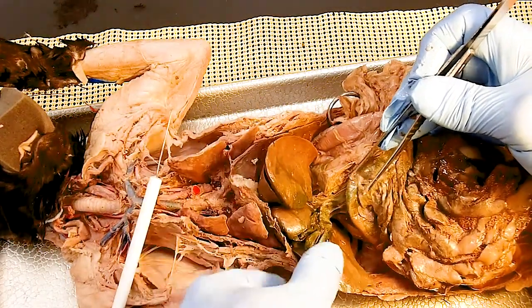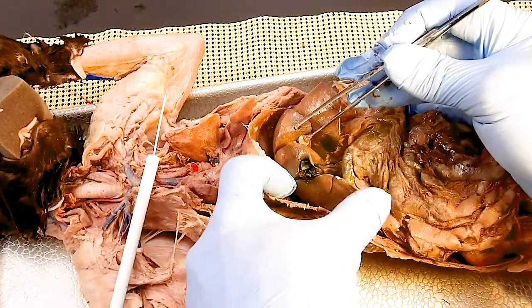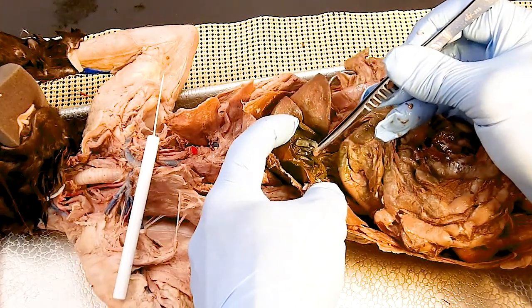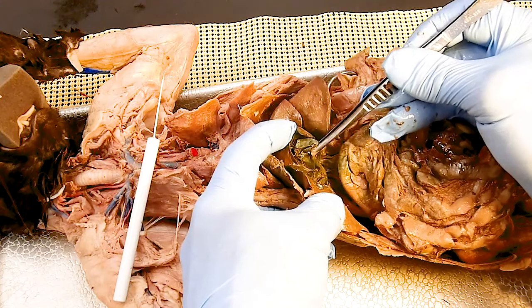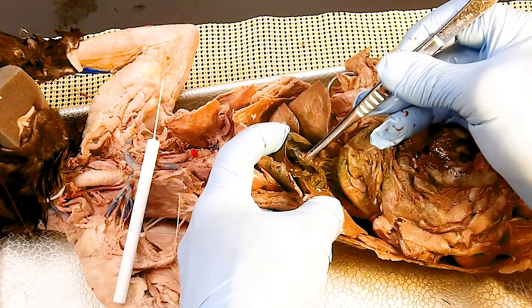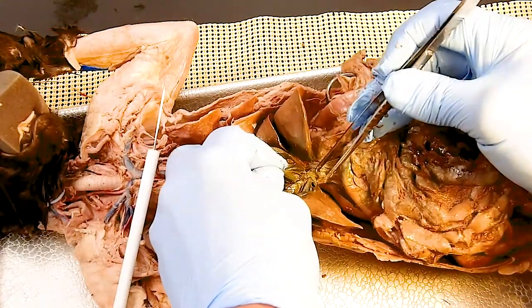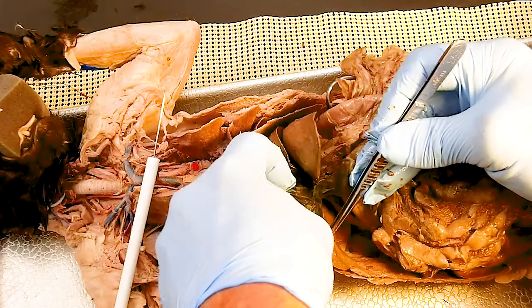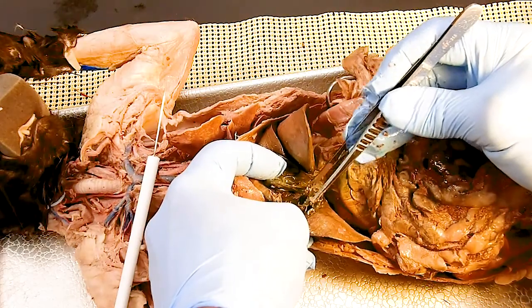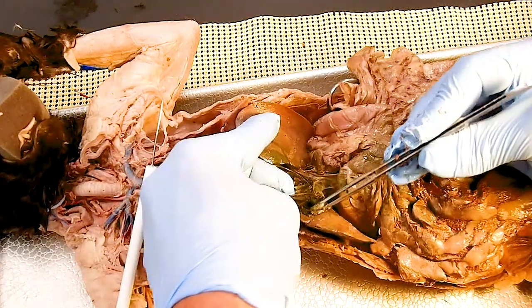You can see the liver here. These are the lobes. Again, you don't have to identify specific lobes on the cat. But right here, between these two lobes, you see this little bag-like structure here. That is the gallbladder, also stained green because of the biliverdin in the bile. Now the ducts I often don't ask on the cat, but coming out of the gallbladder, funny, look, this guy has a gallbladder with two lobes in it. There's one there and one there. I've seen that a time or two.